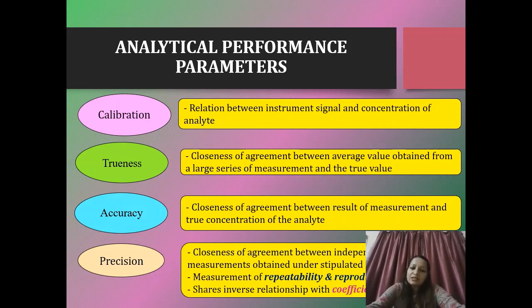This is slightly different from trueness. Trueness is defined as closeness of agreement between the average value obtained from a large series of measurements and the actual or the true value.